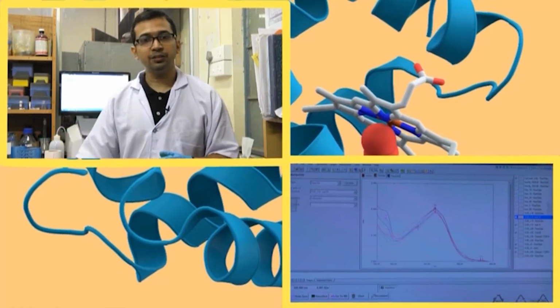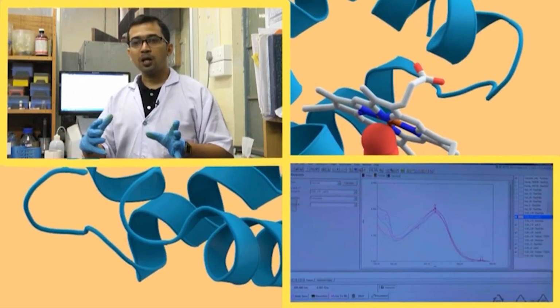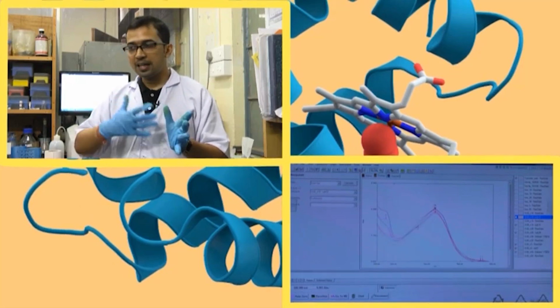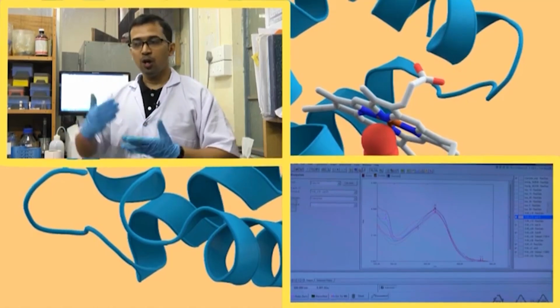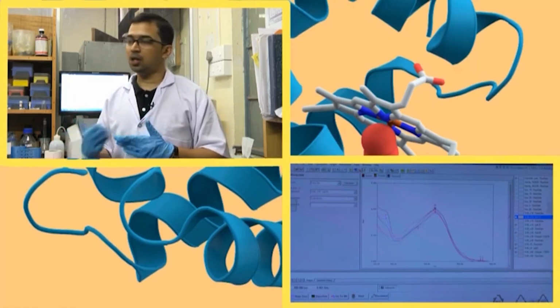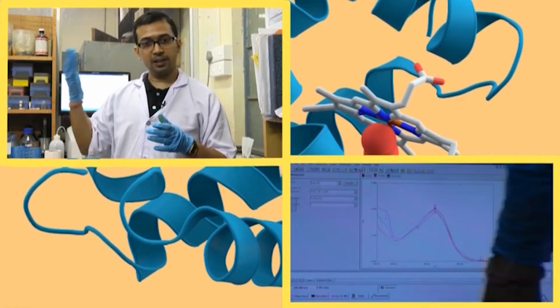So, its absorption increases, the absorption of curcumin increases. Now, again when we are adding more and more concentration of HSA, more and more curcumin are coming in contact with HSA, and more curcumin are getting solubilized in the solution. Initially there was no one to solubilize the curcumin, so it was getting precipitated. As we are increasing the concentration of HSA, more and more curcumin are coming in contact with HSA and its absorbance is increasing.